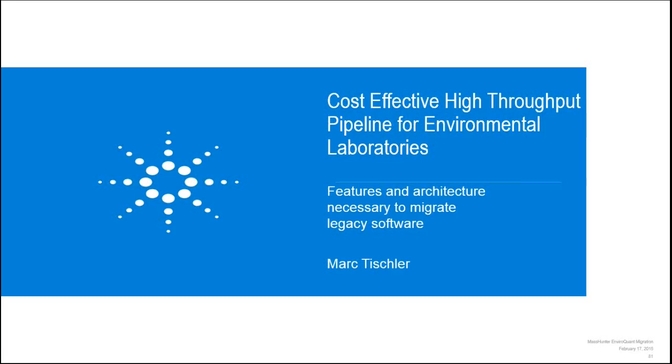Is there going to be continued support for GCMSD ChemStation EnviroQuant, or is Agilent eventually migrating everything to Mass Hunter? Well, the GCMSD ChemStation has a very large installed base, so there's no intent on the immediate horizon to obsolete the GCMSD ChemStation. There's a lot of folks who are embedded in that.